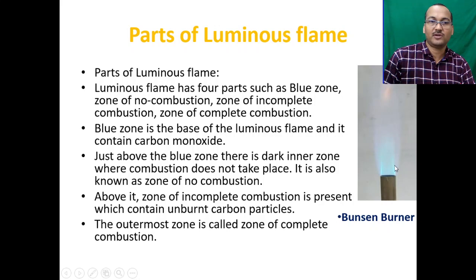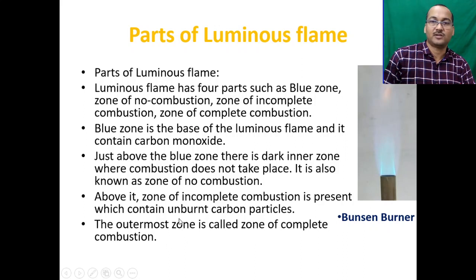You can see the blue zone here. Just above it is a dark inner zone where combustion does not take place — this is also known as the zone of no combustion. Above that, the zone of incomplete combustion is present, which contains unburnt carbon particles. The outermost zone is called the zone of complete combustion. You can see the outer periphery of the flame on the Bunsen burner.